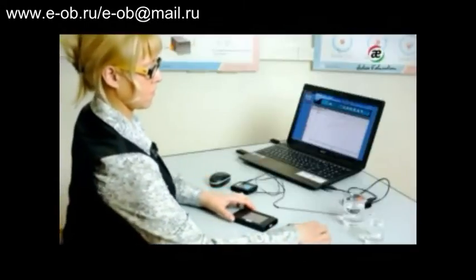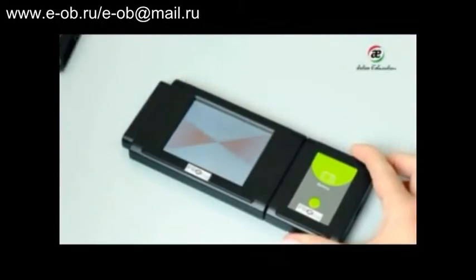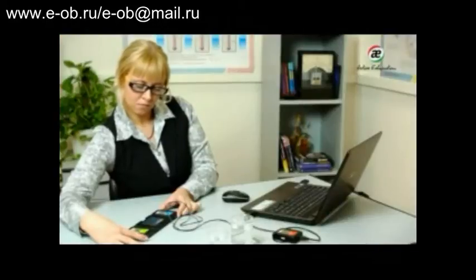For an experiment with the graphic display module, connect it to the battery module. Connect the temperature sensor to the other side. Search for connected sensors should start. Then you will see a module box on the top left-hand side of the screen.